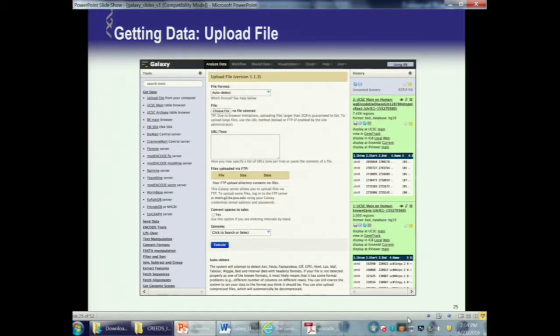Yes, everything will have a coordinate, but a coordinate in yeast is no relation to a coordinate of a gene in human. So generally it's good to separate your histories by the particular workflow you're doing. If you're operating on one project in one organism, and then you switch to doing something different, it's good to have your login create a new history. All your other data from your initial analysis will be there, and this will become a blank history number 2.